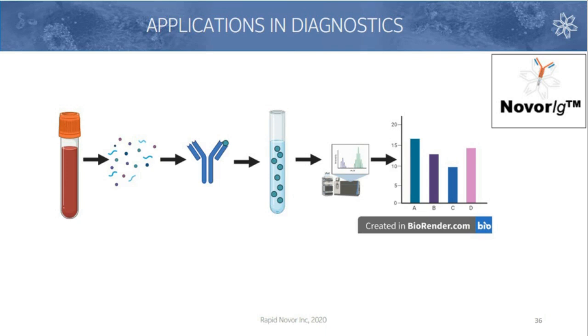Luckily, we've actually developed a pretty robust platform for this, which is seeing some use in clinical cases where of particular interest to us was in immuno-oncology, where we have a particular indication where patients are producing a lot of a monoclonal antibody, and they'd like to track that monoclonal antibody over time.